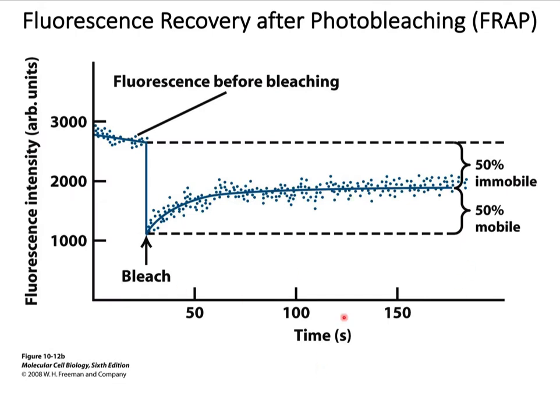There is a way to quantify the amount of fluorescence. You can collect the fluorescence intensity using arbitrary units and quantify the fluorescence from that spot. So you can see the fluorescence of that spot before it was bleached is emitting approximately 3000 fluorescence intensity units, and immediately after bleaching, the intensity drops to 1000 fluorescence intensity units, and then during recovery about 150 seconds, it rises to about 2000 fluorescence intensity, which is about 50% fluorescence in that area.